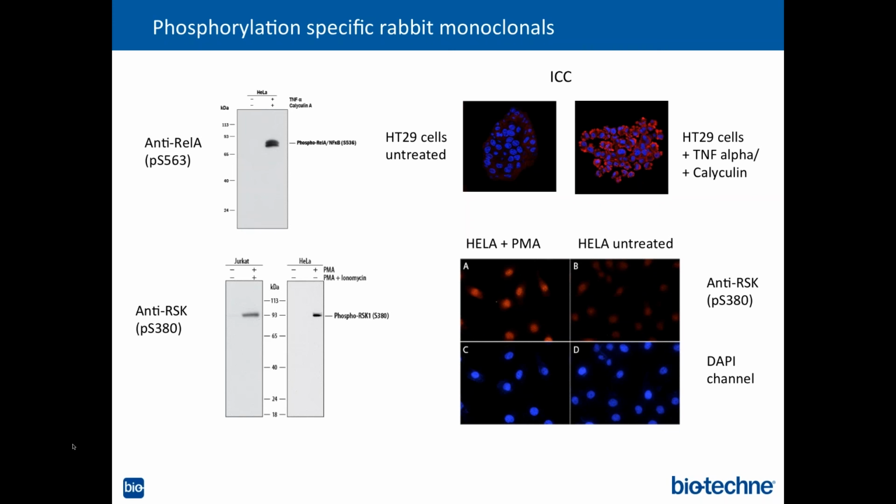The second target I wanted to show you is the anti-RSK. This is phosphorylation site serine 380.